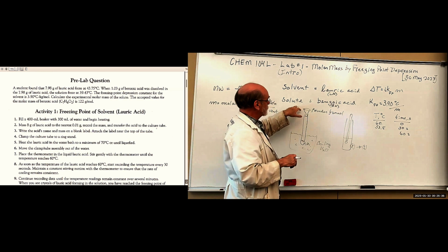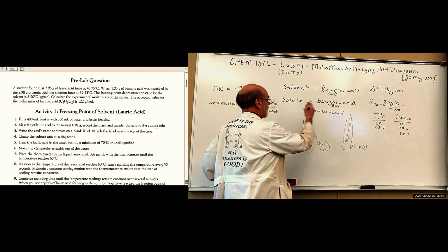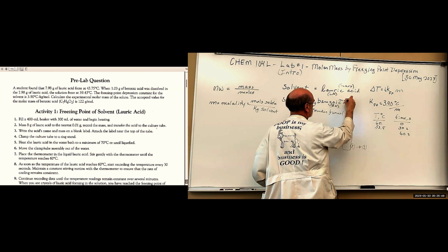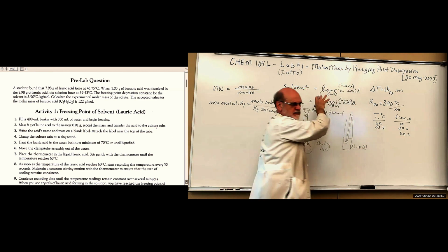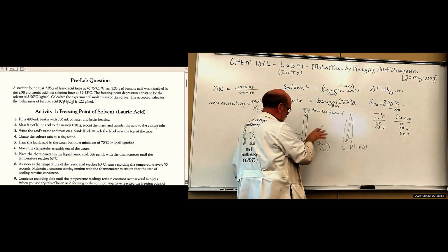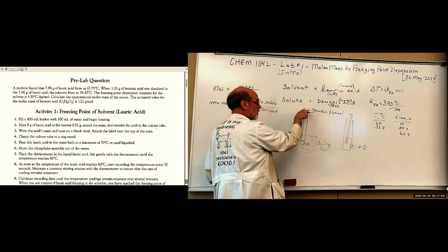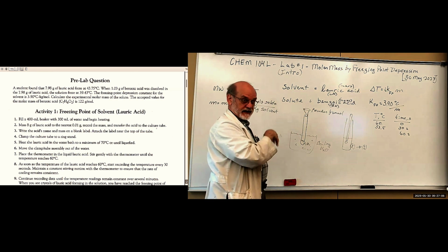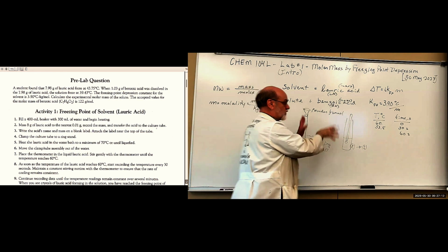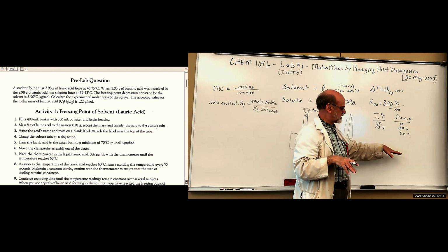Then we weigh out a certain amount. We have a mass for this one, right? You have to have a mass for that one. So you're gonna have a mass here. And then you're going to weigh out a mass here, right? I don't know what, maybe 8 grams or so, something like that. And then maybe a gram of this. And then you remelt this, right? Put it back over here, remelt it, and then you add your benzoic acid. Okay, and let it dissolve, melts and dissolves. Then you bring it out and do the whole thing over again. And you get 2 different temperature data sets.